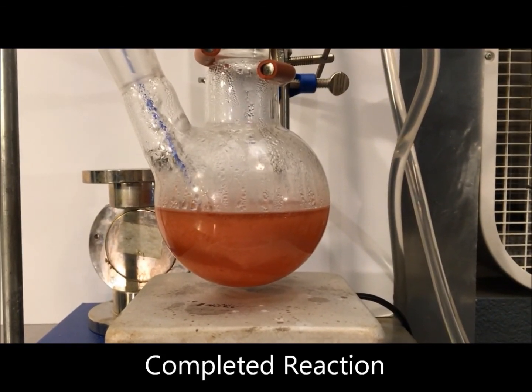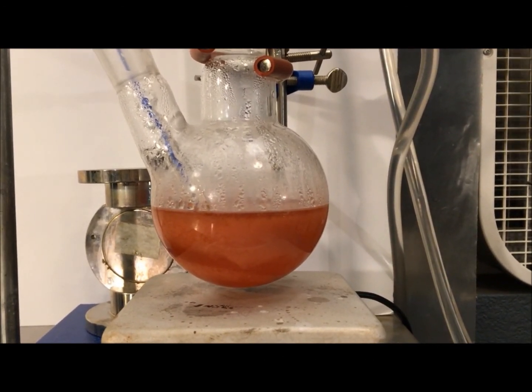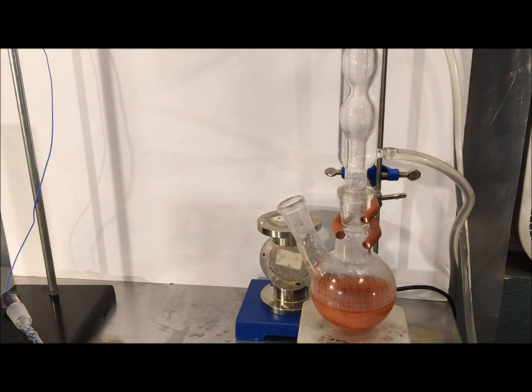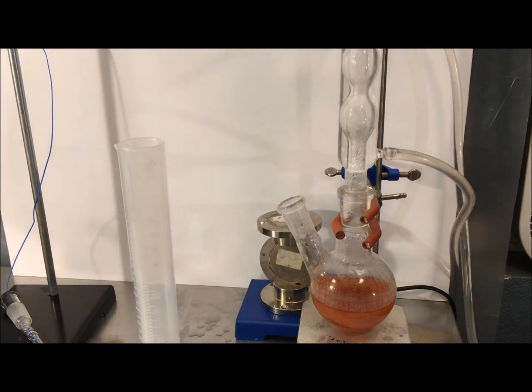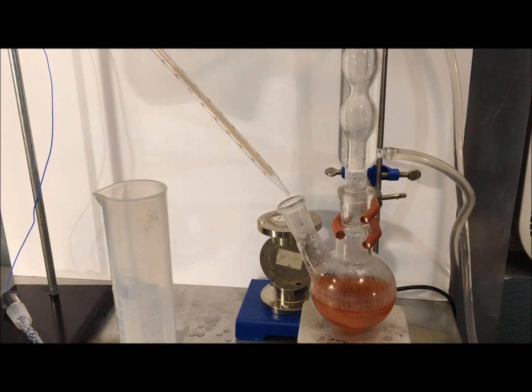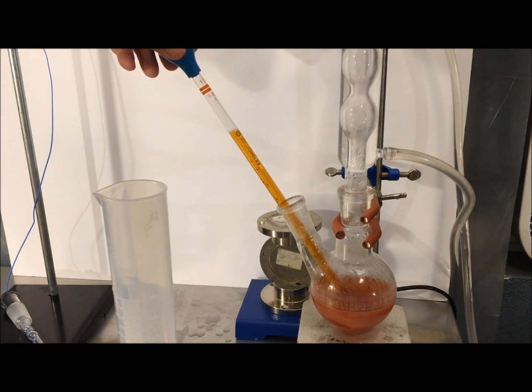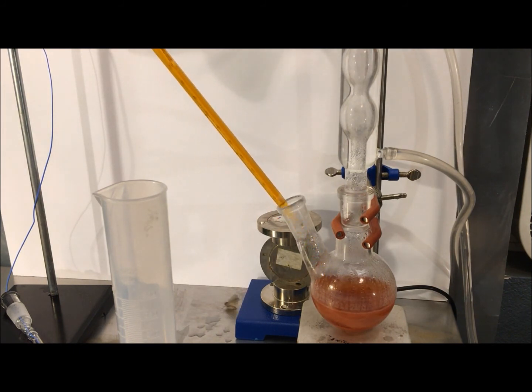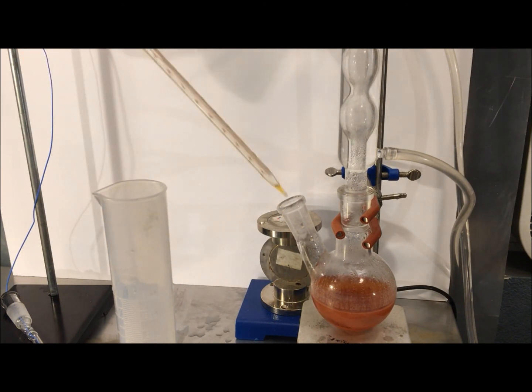So here's what it should look like when it's finished. Next we'll transfer it to a graduated cylinder so we can measure the amount of product. This is also a good time to record your audition for those stock footage reels of people pipetting in those news segments about medical technology.